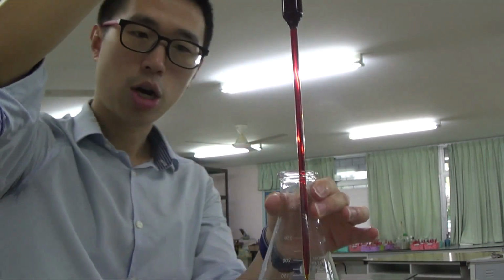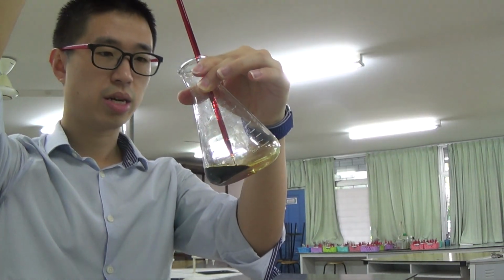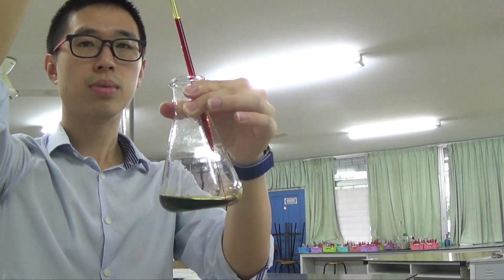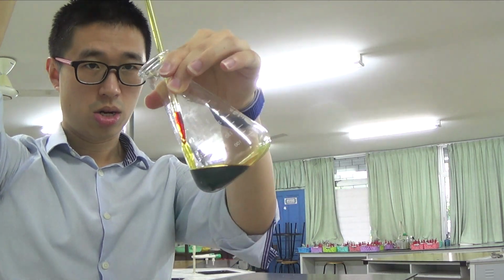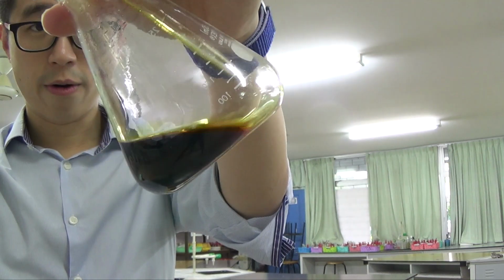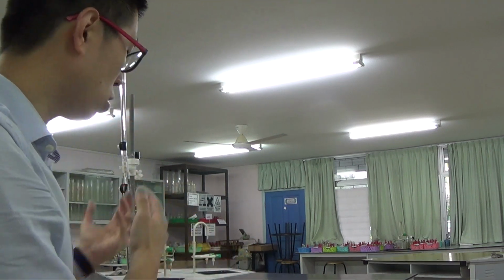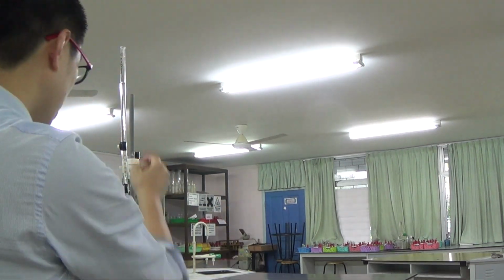Let gravity do its job, and you should be alright. So just down to the last couple of drops, 1, 2, 3, 4, 5, 6, 7. You will see I've only prepared 2 conical flasks. That's because I'm going to do one rough titration so that I know roughly where I will stop, and I will do at least 2 exact titrations. But I only have 2 conical flasks, so I'll have to wash out one of my conical flasks and redo it in one of the washed conical flasks. Okay, so let's get started.